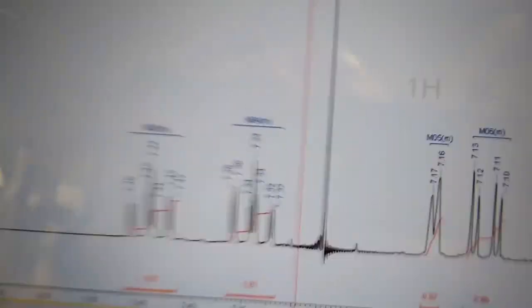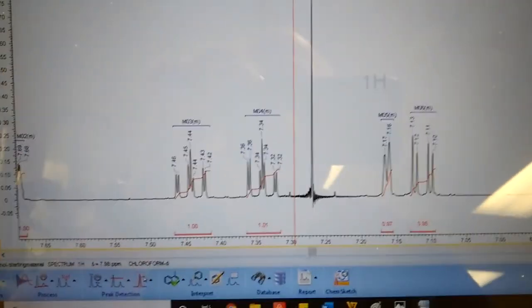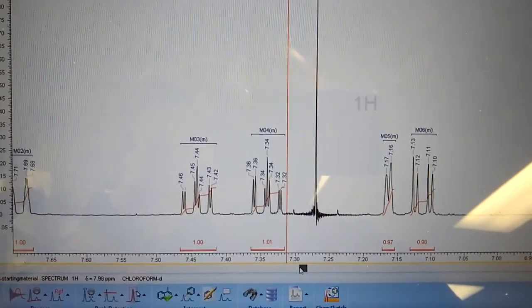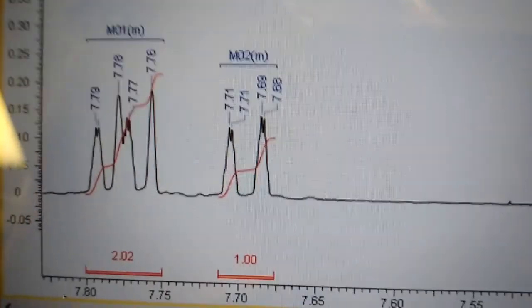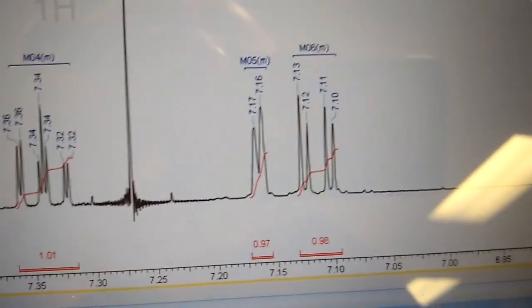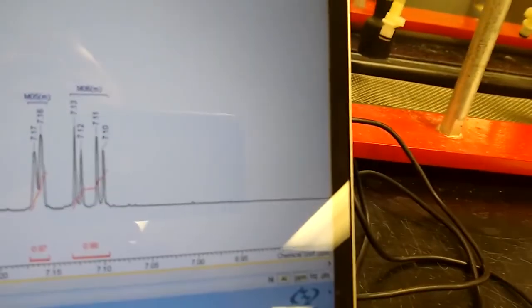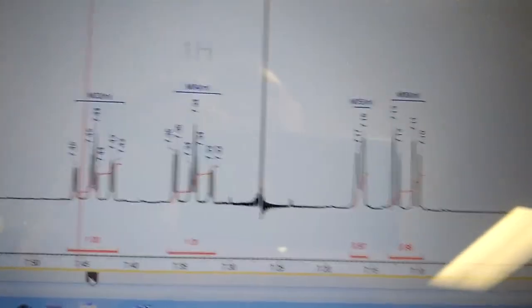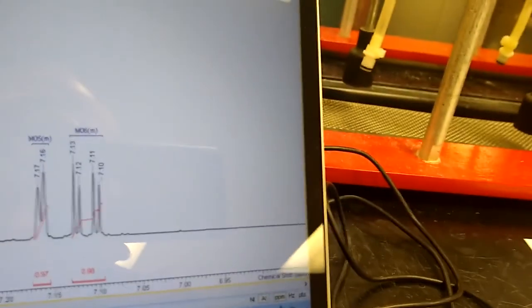So of your seven aromatics that you should have, you should have a two H multiplet, one H doublet, one H doublet, one H triplet, one H doublet, and one H doublet. And then that one we had down here was just a one H singlet. The first seven you would call them aromatic, the other one you would have as an OH.